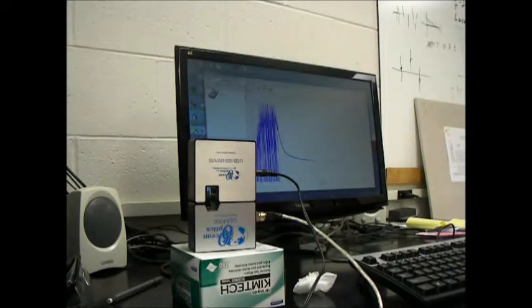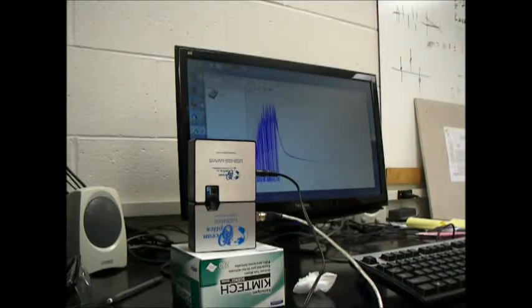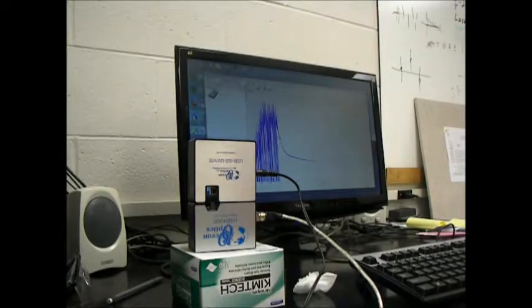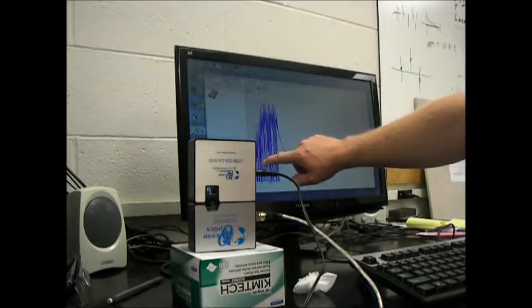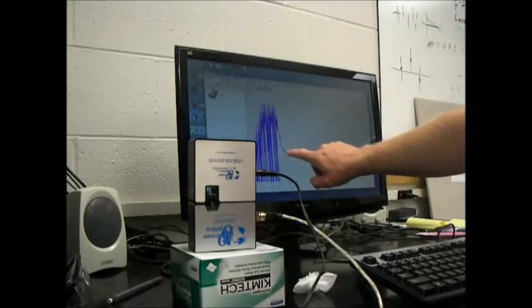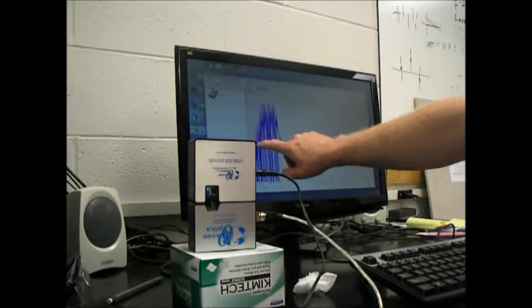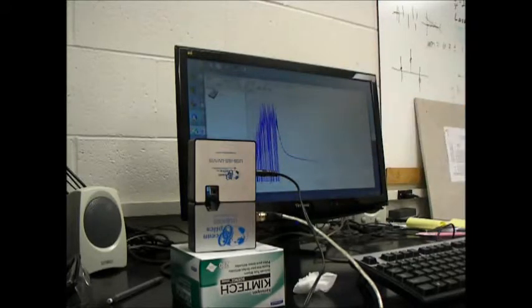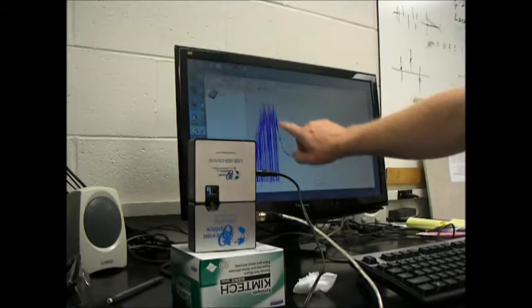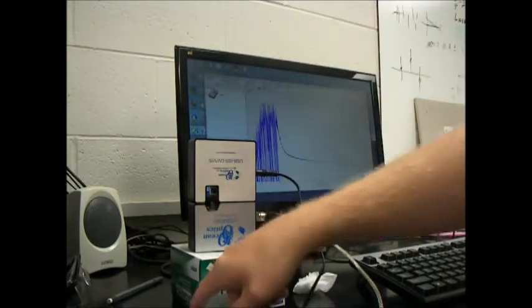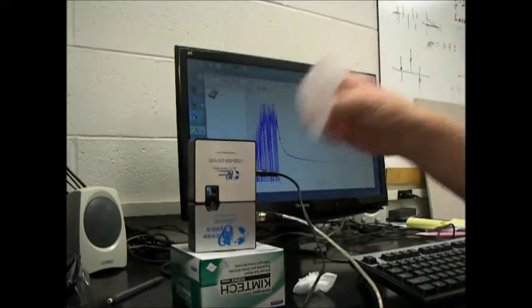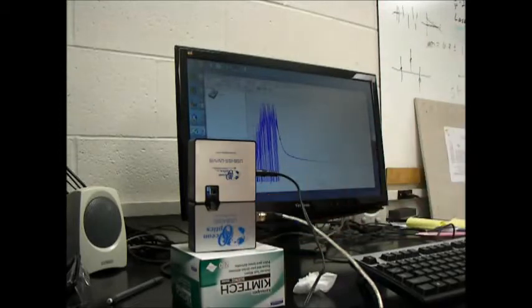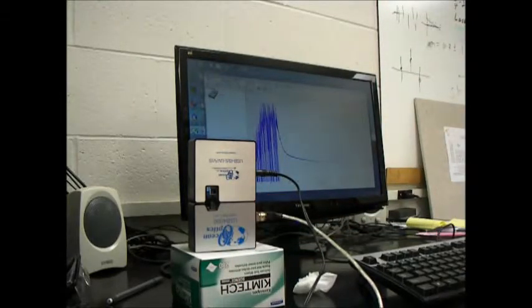This one is really dirty, so there's a lot of noise. I'm going to click Play, Pause. If it wasn't a dirty sample, I would just have one nice peak right here. It has some sticky stuff on it. So that's how you take your data.